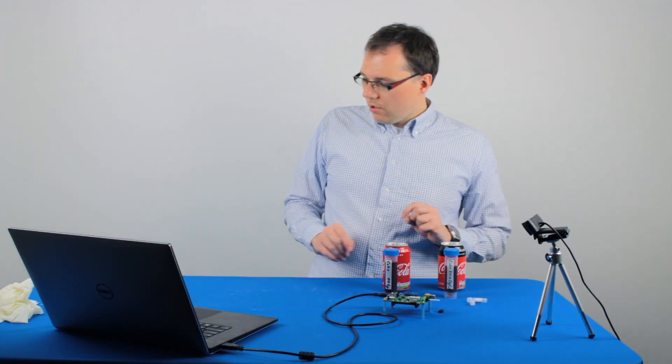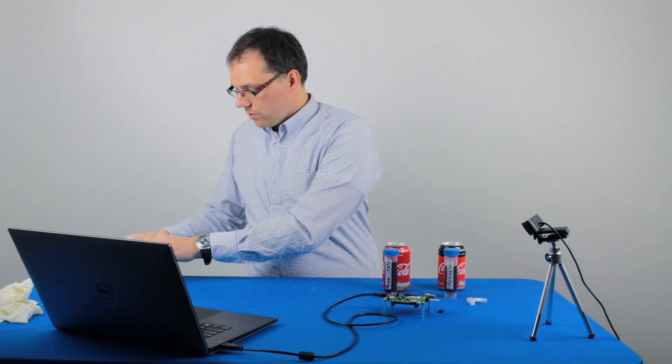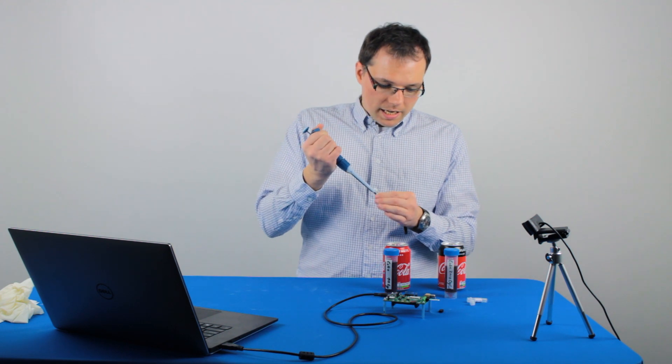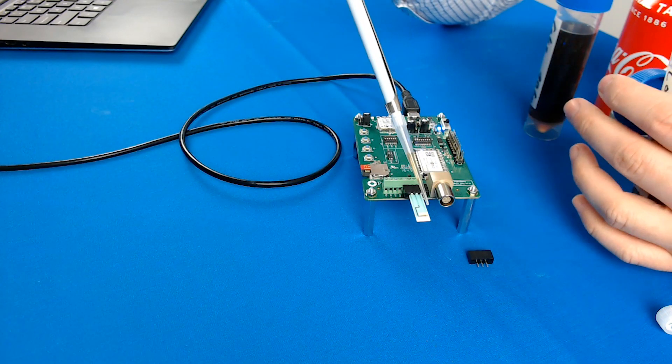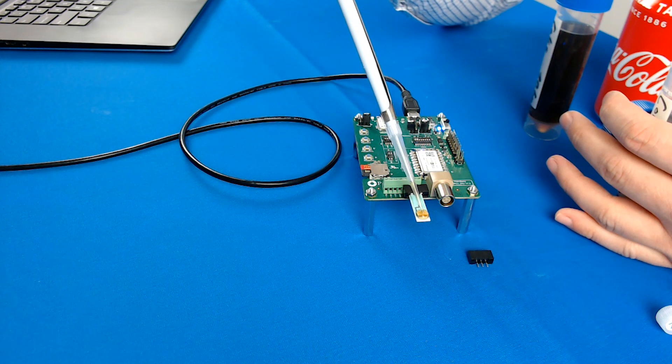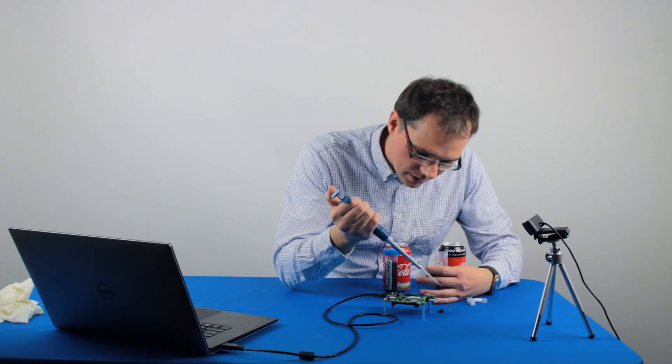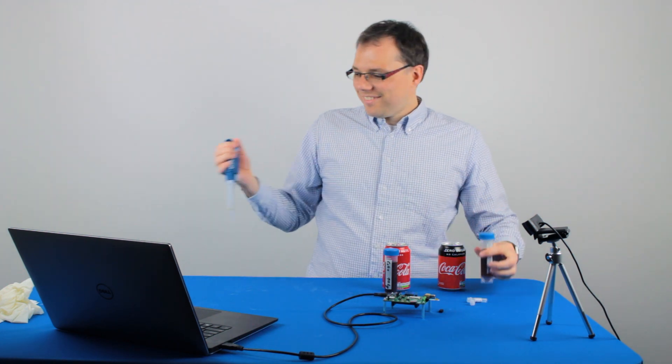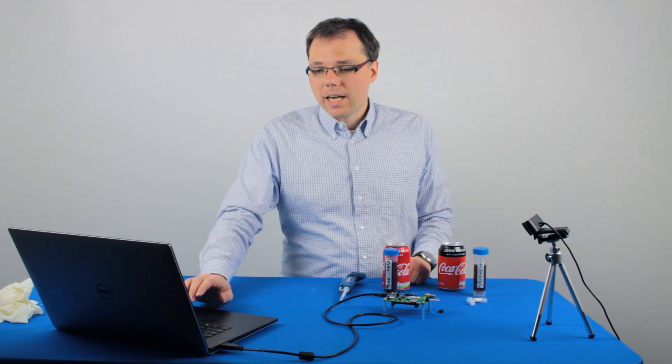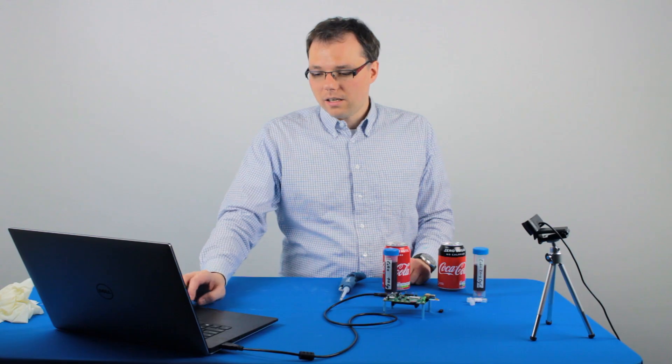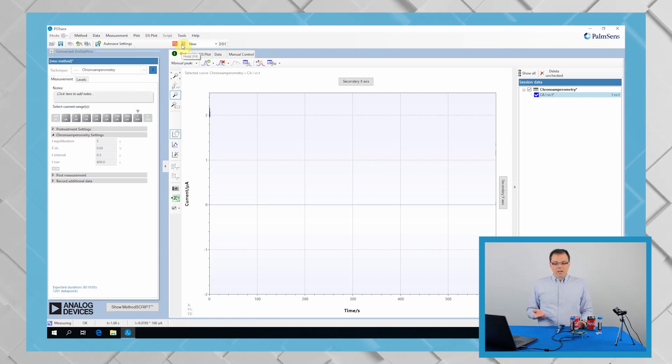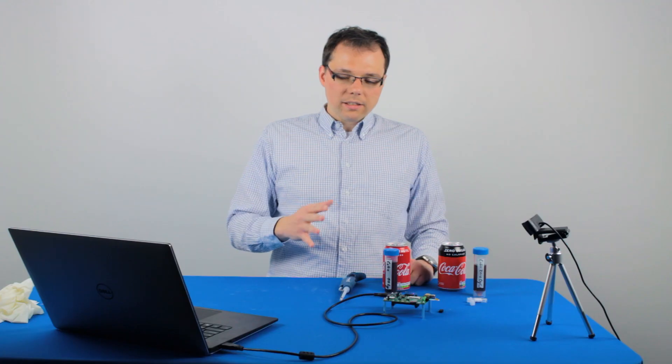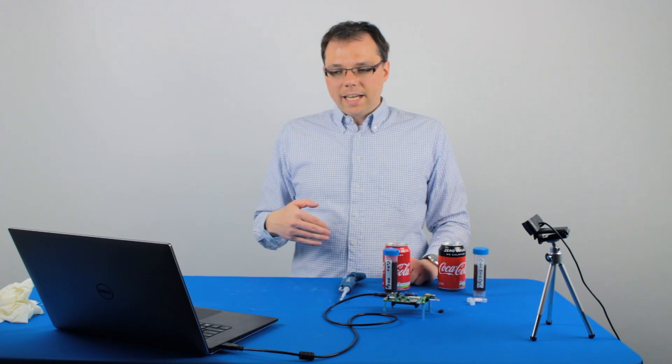Then we are going to apply 100 microliters of the Coke Zero, the sugar-free Coke. When you do that, you should take care that all three electrodes are covered with the Coke - the silver ones and the carbon one. Now we have covered the electrodes and set all our parameters, so we can start our measurement.